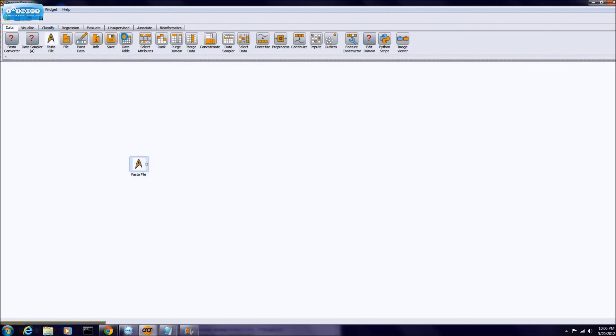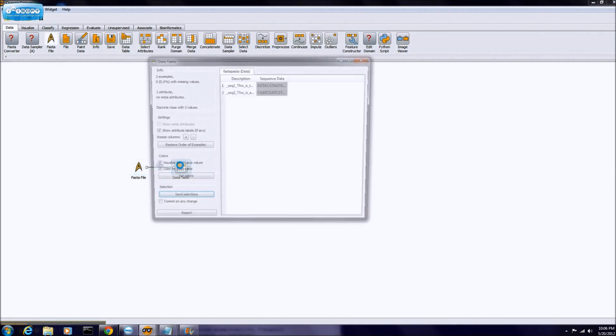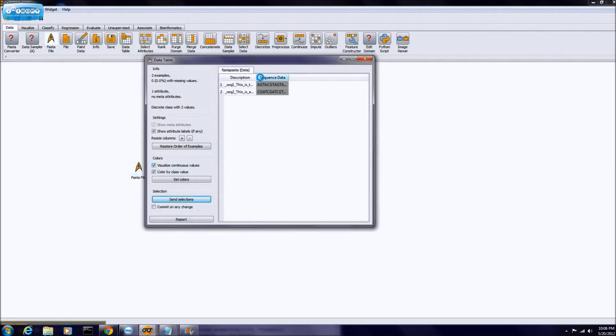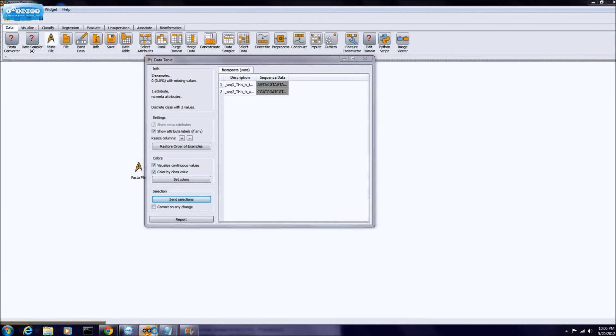Next, we go to data table, and we can see our beautiful FASTA file and it's tabbed a little bit of format. Amazing, right? Computers, how do they work?